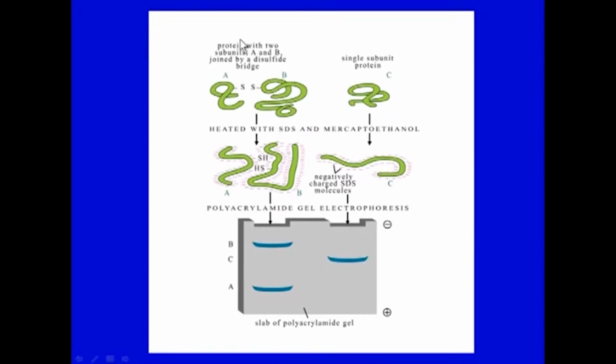in denaturing conditions. Now, if you can see in the figure, you have two samples here. One protein is having disulfide linkages, one is without disulfide. Now, when they are heated in the presence of mercaptoethanol, these disulfide links are broken. It is a reducing agent, so it reduces them. Then a single protein, though it is made of two polypeptide chains, will be seen as two separate bands in the reducing gel.